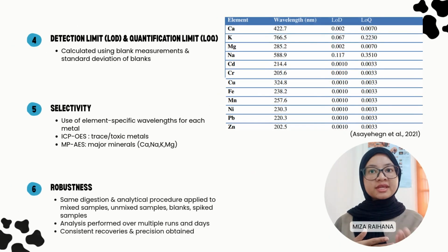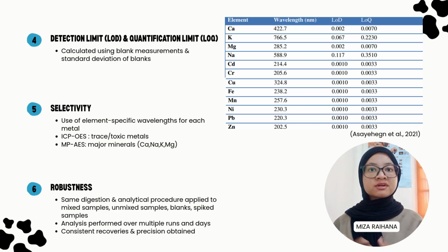Detection limit (LOD) and quantification limit (LOQ) were calculated using blank measurements and the standard deviation of blanks. Detection limits can be seen around 0.001 mg/L. ICP-OES has a low detection limit suitable for trace metal analysis.